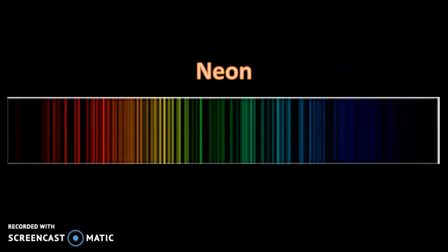Now think about that. You have neon now. It has a whole full shell of extra electrons than the helium does. And look at what that does to the overall spectral image. Look at how complicated that is and how many different electron jumps. Because remember, every single one of those little bands of color coordinates with an electron jump. Let's keep going with our observations.